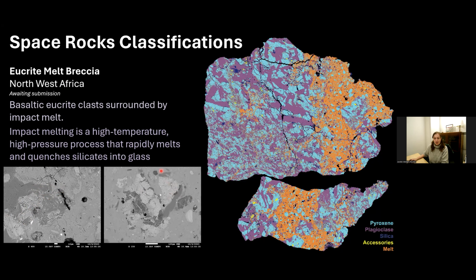But we can also see the partial melting inside these impact melt veins. So people might use these to work out shock and pressure conditions, how shock and pressure might affect basalts, and what was happening on an asteroid really, really long ago.